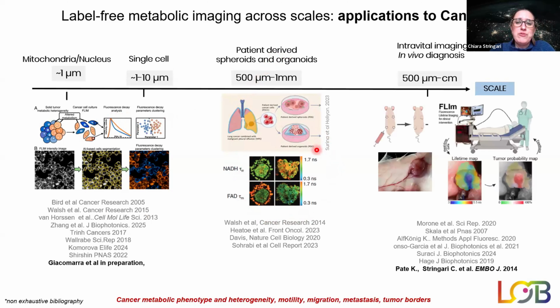metastasis. And of course, if you go to a larger scale, intravital imaging or in vivo diagnosis, you can image the entire or larger area, or with a mesoscopic approach developed by Laura Marcu's lab mainly. You can also delineate, for example, tumor borders.